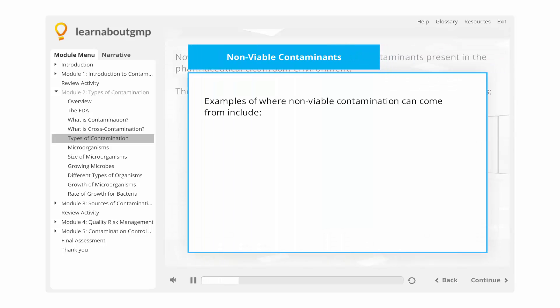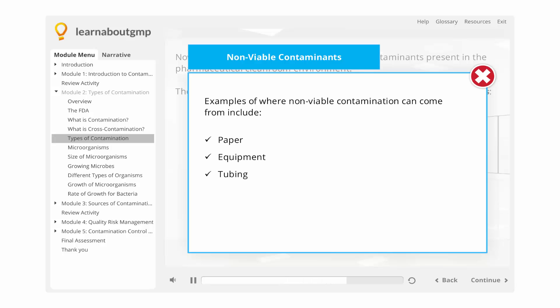Examples of where non-viable contamination can come from include paper, equipment, tubing, rust, dust, and disinfectants.